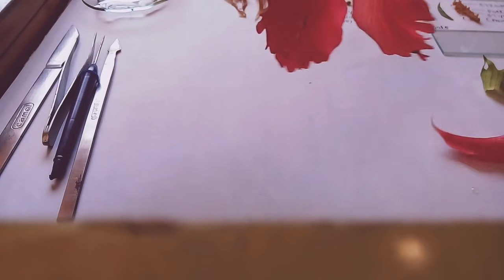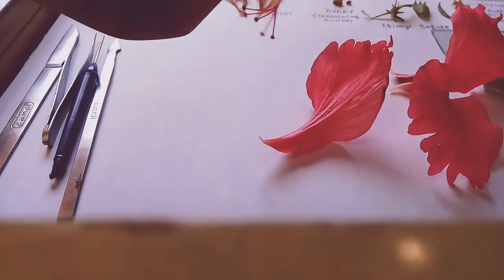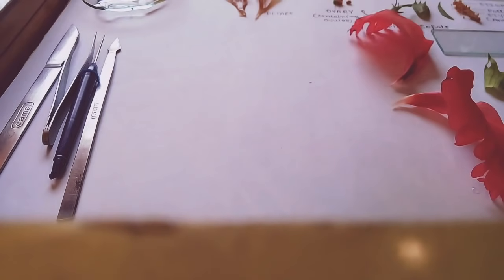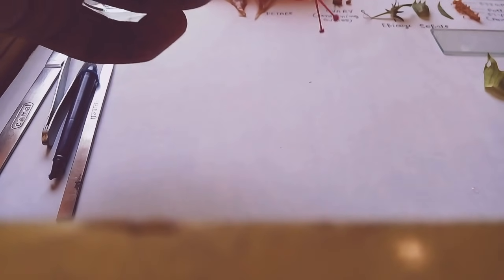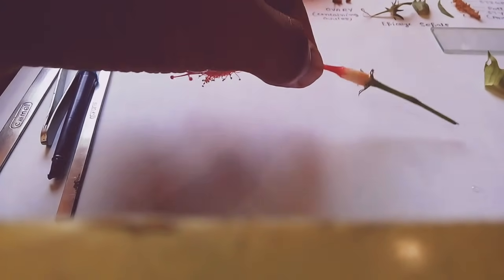The next part is to remove the petals. Just like the sepals, I'm going to remove the petals very carefully. These are the petals — the red part. So I have removed the petals. The next part is that we have to split open the style of the flower.